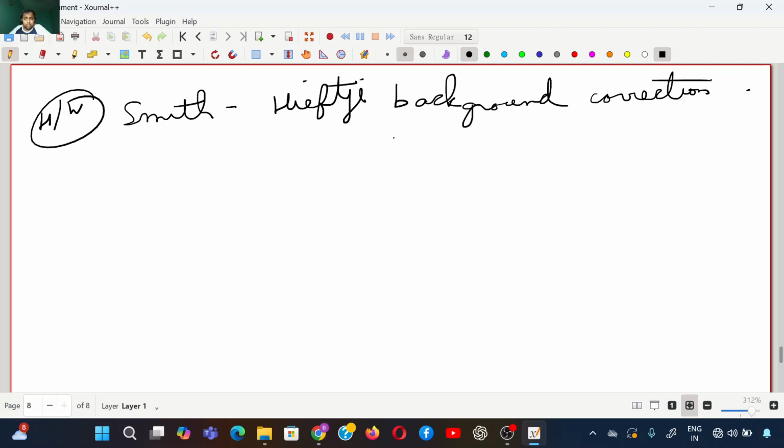In this case, you alternate between high and low current every 5 milliseconds. In case of low current, you will have the normal AA spectrum, and in case of high current, the lamp line broadens and undergoes self-reversal. That is, the resonance line intensity is minimized, and you get mostly background signal. So you subtract these two signals, and you get the background corrected absorbance. In this case, there is no magnetic field needed. Very simple design. So it's good for analysis where Zeeman systems are not available.